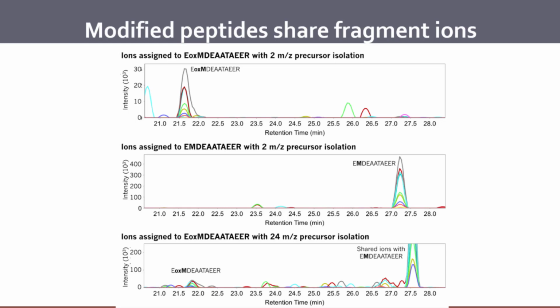You need to have your DIA windows less than 4, and you need to have your retention times be fairly accurate. Yeah, how good do you think the retention time dimension is? If in this case you have different precursors anyway, but if it's just a swap in amino acids, does it often help? Yes, it does. Even deamidation causes a fairly significant shift in retention time. So in almost all cases, it really does. I'll show you cases in a bit, like positional isomers, where it doesn't always. And there you really can't do much unless you have fragment ions that distinguish between the different positional isomers.